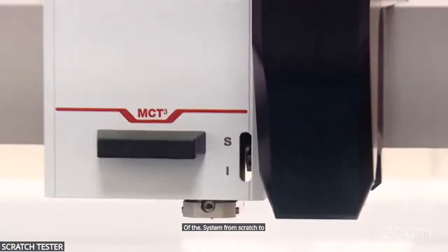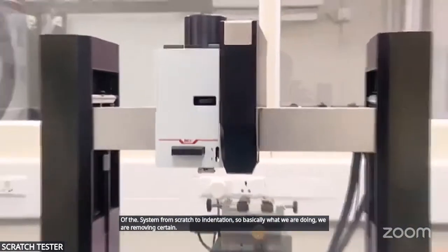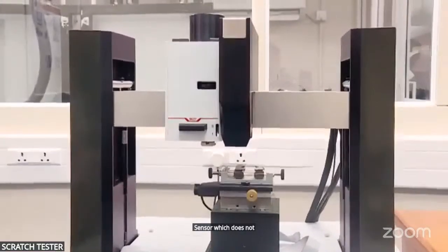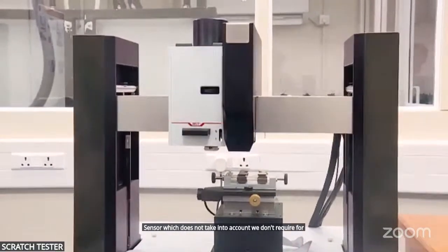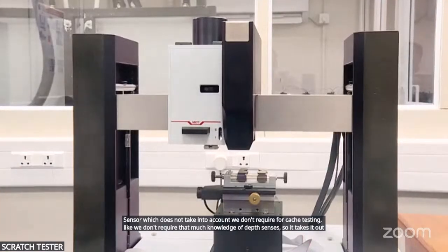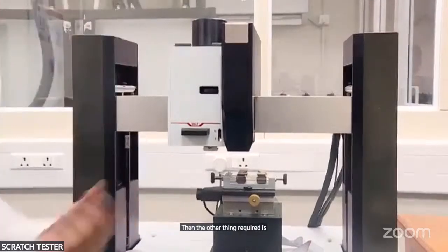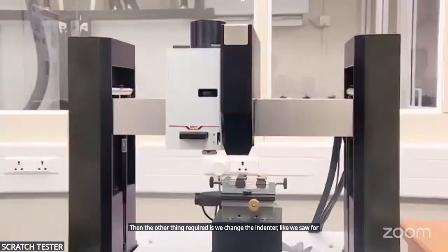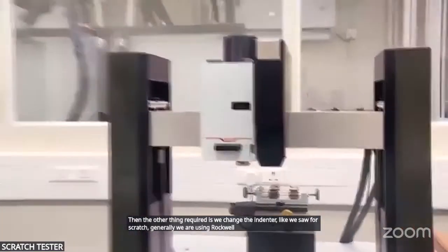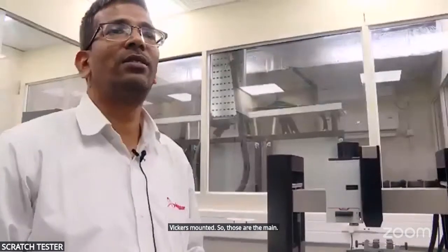Basically we are removing a certain sensor which we don't require for scratch testing, like we don't require that much depth sensing, so it takes it out of the picture. Then the other thing required is we change the indenter. For scratch we generally use a Rockwell indenter, and here currently we have a Vickers mounted. So those are the two main things we have to do.